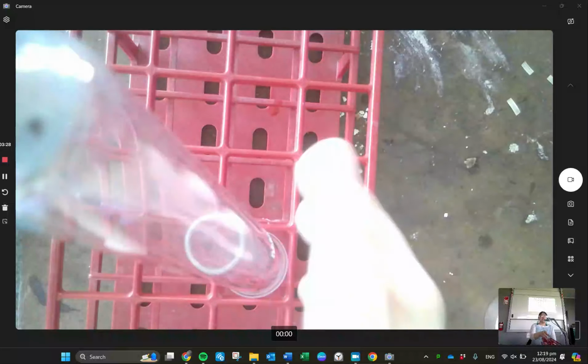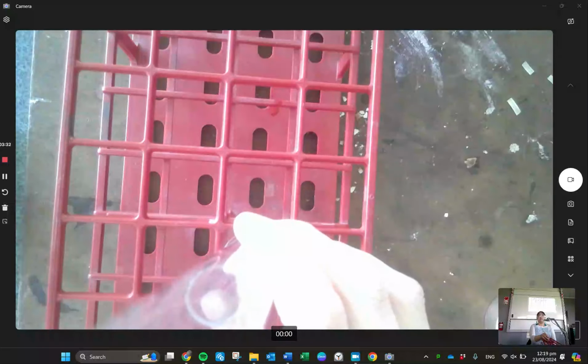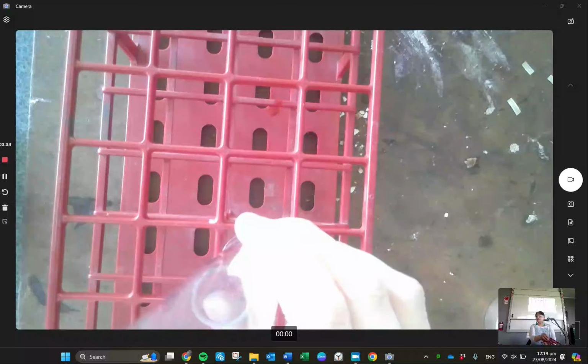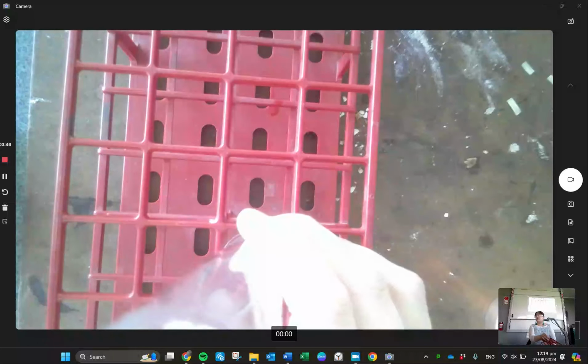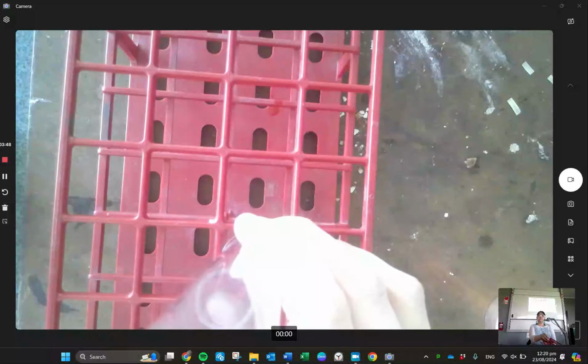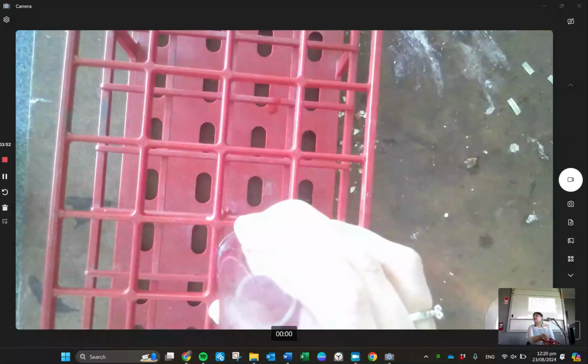And you're going to take your test tube that is hopefully filled with some sort of gas, and we're going to put it over the flame and see if it pops. Light the candle. Take the test tube with hopefully whatever gas has been trapped and put it over the flame and see what happens. If it pops, it's hydrogen. If it doesn't pop, it must be sulfur dioxide. Make sure it all reacts together, so make sure there's no more magnesium in there. Once the magnesium's gone, then you know you've reacted everything.